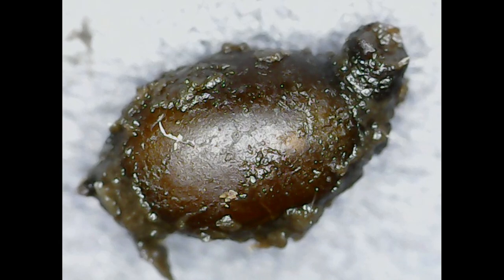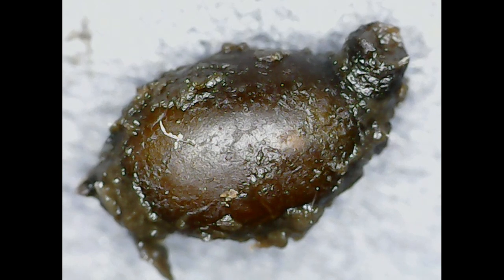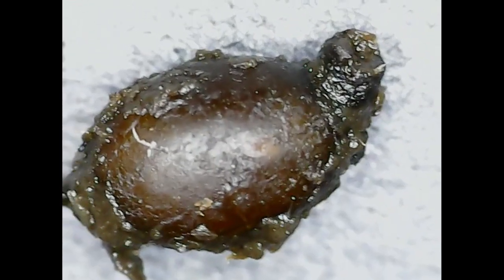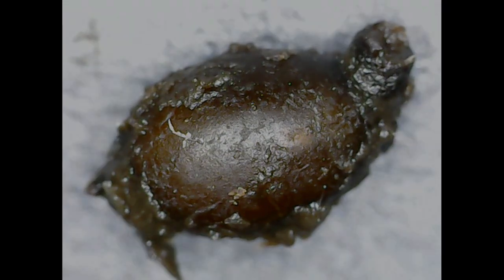All right. So there is a worm cocoon. And I saw movement. I'm seeing if it'll move again. It hasn't hatched yet. So, let's see how close we can actually get to this. I'm only about 400 zoom right now. Let's go closer. That is about as close as I can focus.